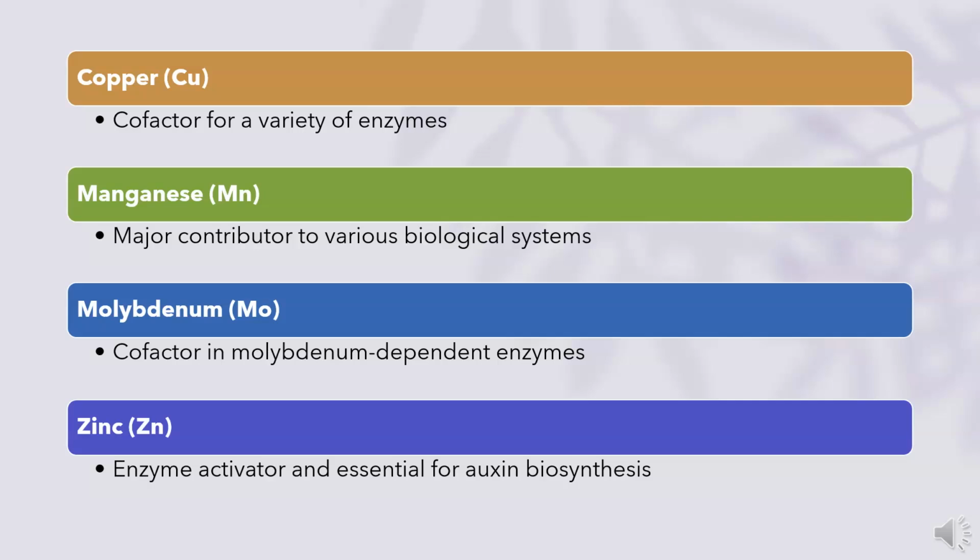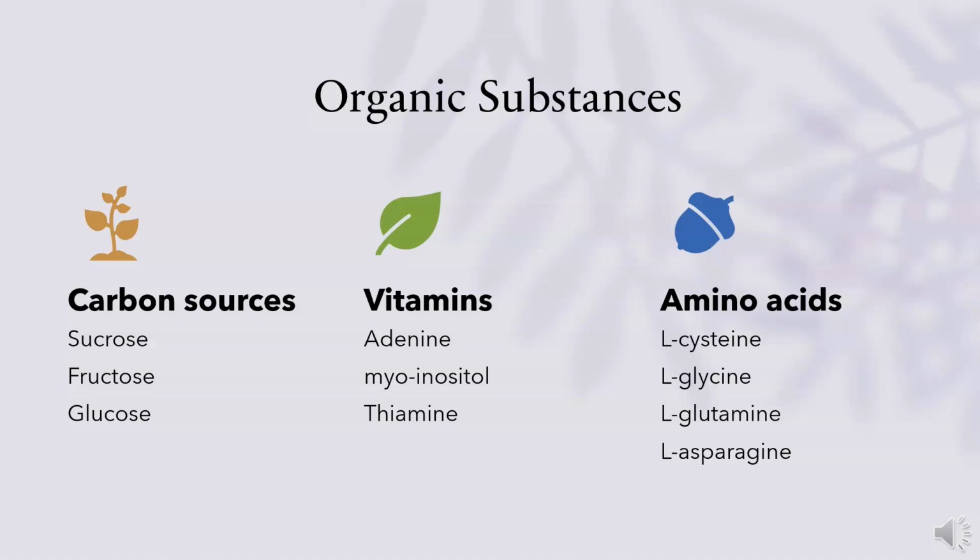Organic substances are compounds containing carbon, such as carbohydrates, proteins, hormones, and enzymes. They are not usually provided to plants, because plants typically produce their own food. However, plants in culture are often too small or incomplete to synthesize all the organic chemicals they need, so these substances must be added to the tissue culture media to supplement the plantlet's atmospheric or self-generated supply.